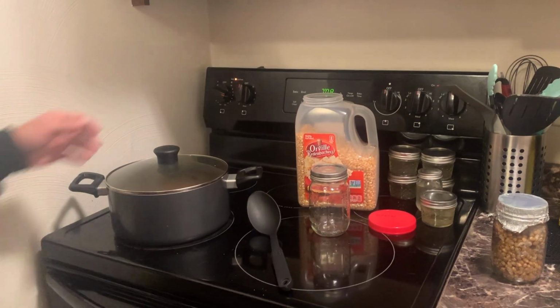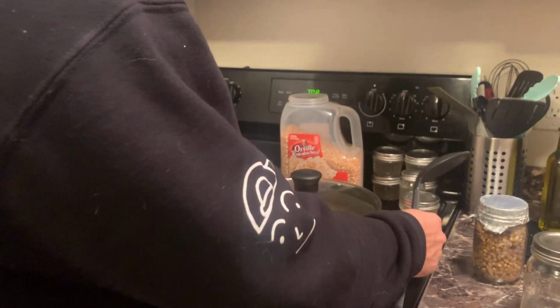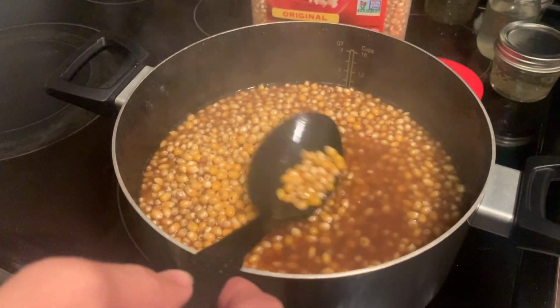All right, now that it's been about 45 minutes, I'm gonna go ahead and turn the stove off and take this off the burner. As you can see, a lot of the water is boiled away. That's why I say you gotta make sure you add a lot of water.